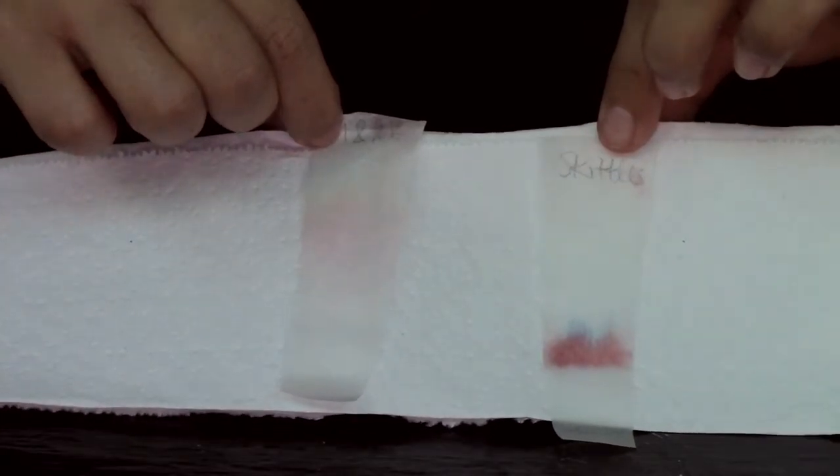Let's figure out what exactly happened. That was pretty cool how we saw the different colors separate in the candy coating, right? But what exactly happened? Well, when the filter paper was placed in the water, water molecules were drawn up the filter paper through capillary action. Capillary action is the ability of liquids to move against gravity in narrow spaces, such as the filter paper. As the water passed the candy coating smudge, it picked up the dye in the smudge.